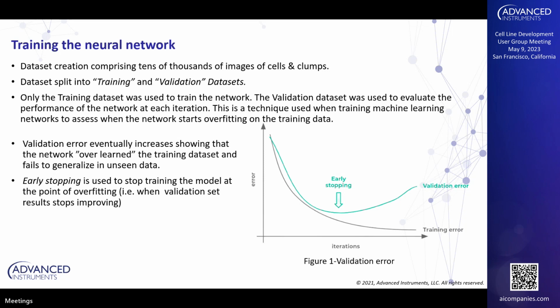Once the network has seen all of the training sets of data, it's then fed a set of new data that it hasn't seen before, which is the validation set. If it correctly classifies the data fed into that set up to a certain percentage, then it's fed back to the folks at R&D to further validate it before it's released into the final version of the software.